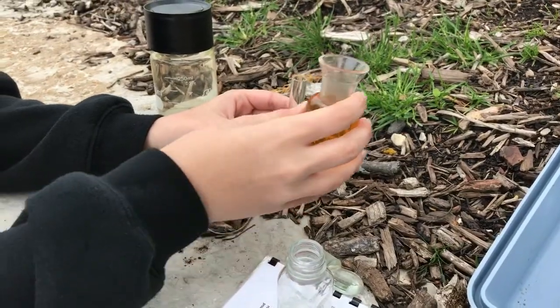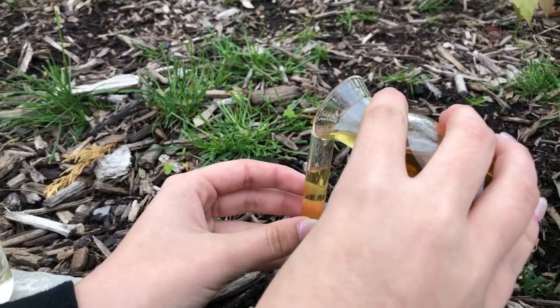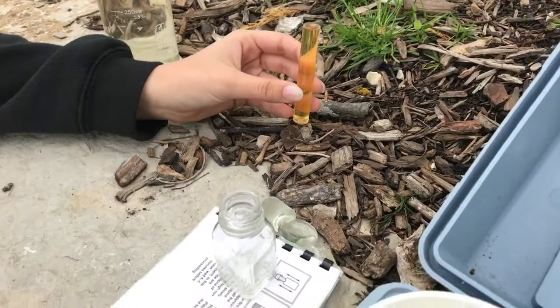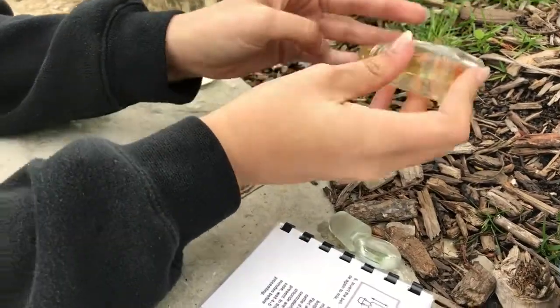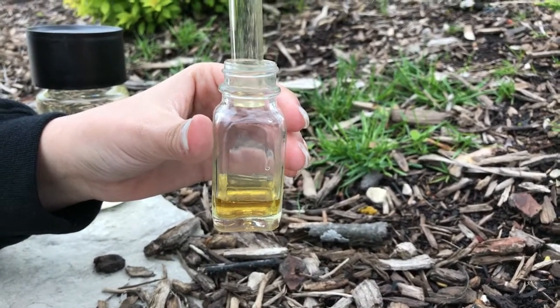After it has settled, pour the solution into a smaller container until it is filled to get the proper amount. Next, put the smaller container on top of the smallest and invert once again so that none of the dosage is spilled, making sure all of it is emptied into the container.